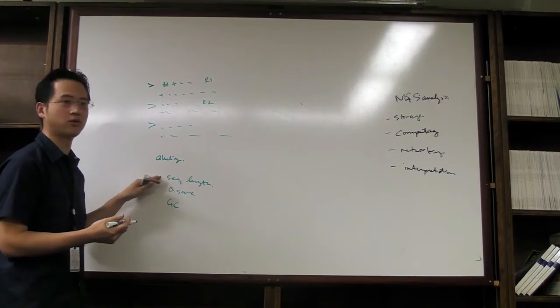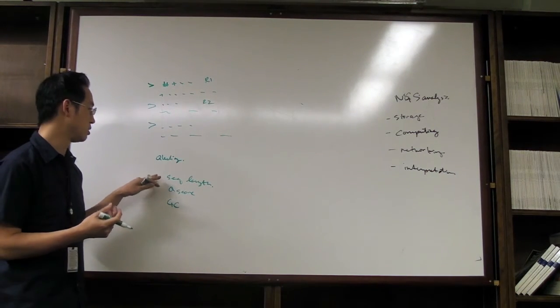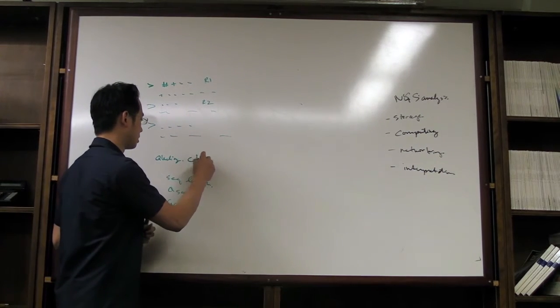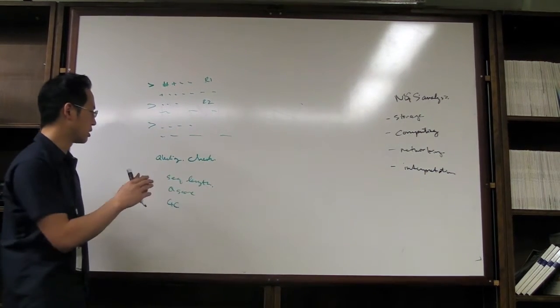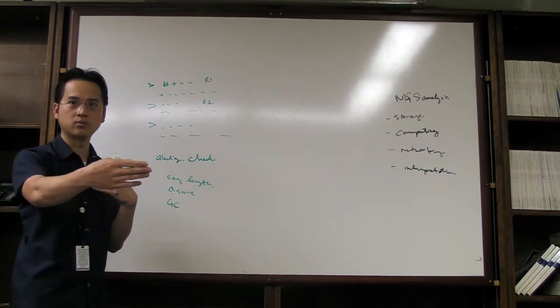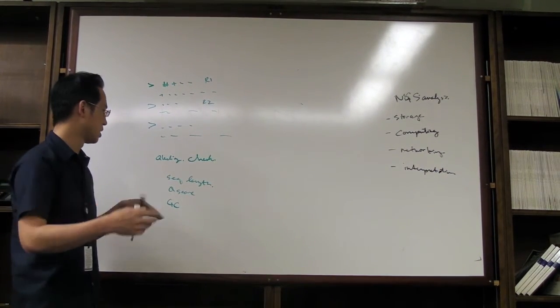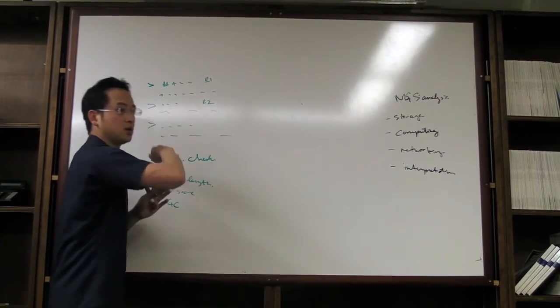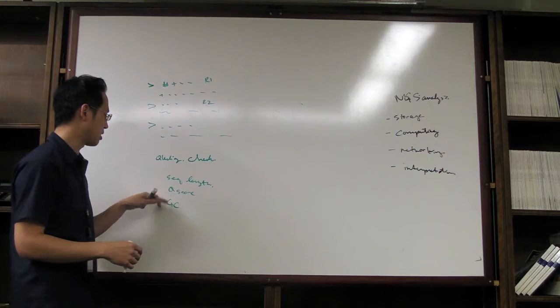So you want to check first to see whether it was a good run or a crappy run. And that's why you want to do an overall quality check of your sequence. And so you can look at, if I'm sequencing 100 paired-end, do I always get 100 paired-end in both directions? My Q-scores, do they peter out at the 10th base or do they go out very long? You can look at that.